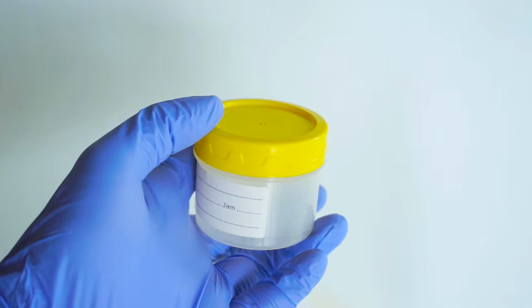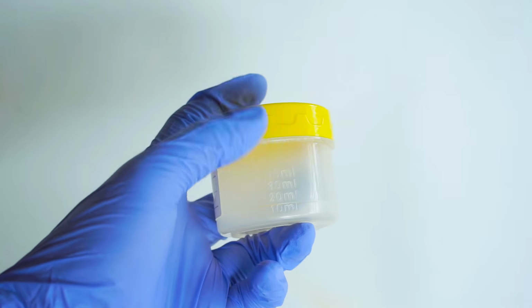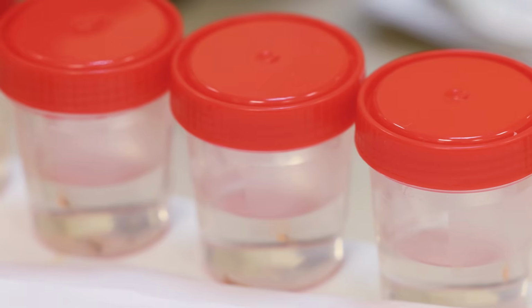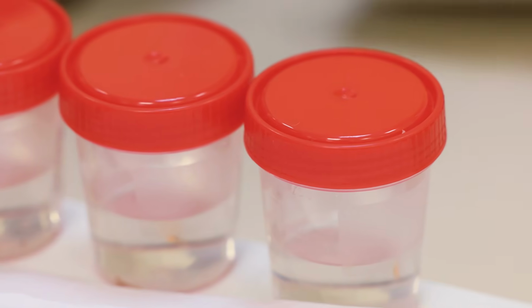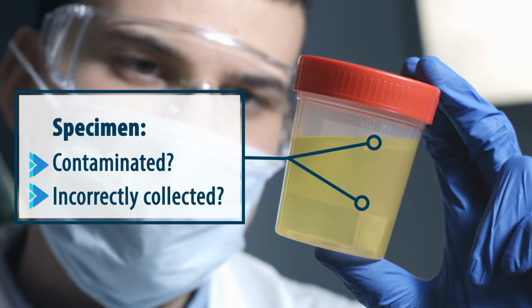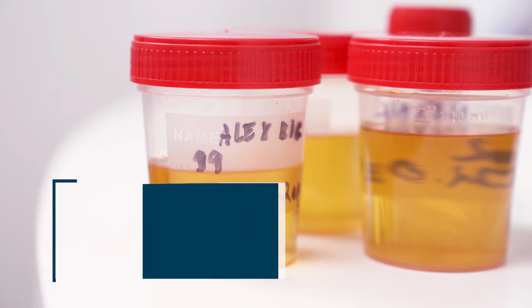When preparing for a PPM procedure, you must ensure you collect the correct patient specimen from the patient. This is vital to ensure accurate test results. Following best practices for specimen collection and handling is crucial to avoid errors. Contaminated or incorrectly collected specimens will impact the accuracy of the test results. You are responsible for accurately labeling and properly storing each specimen.